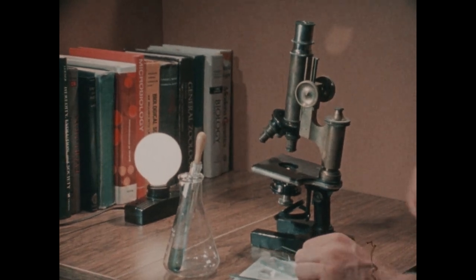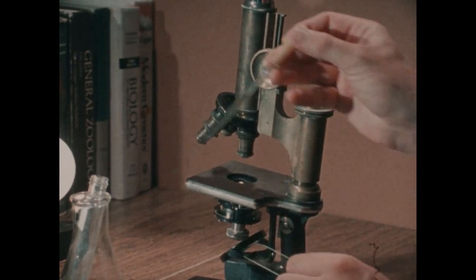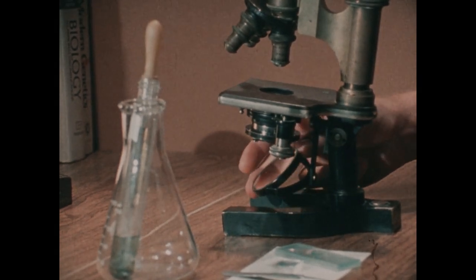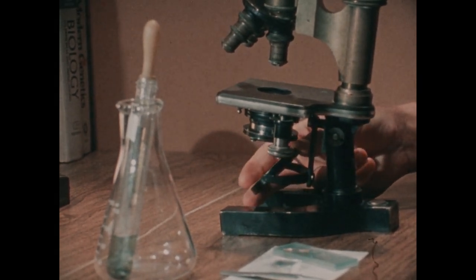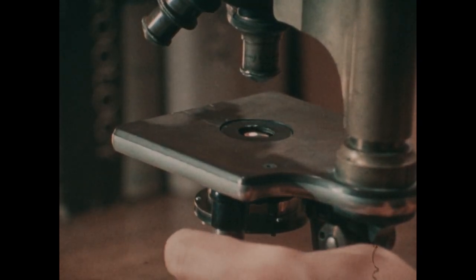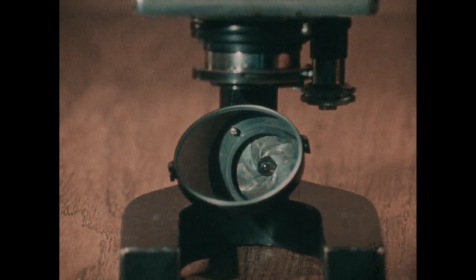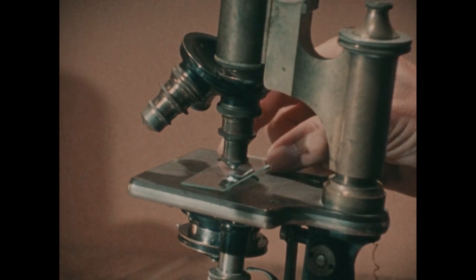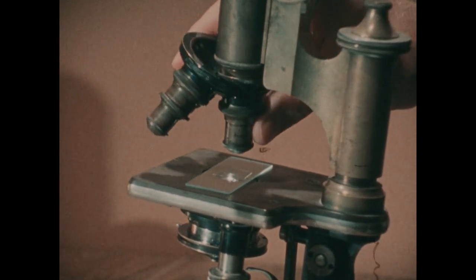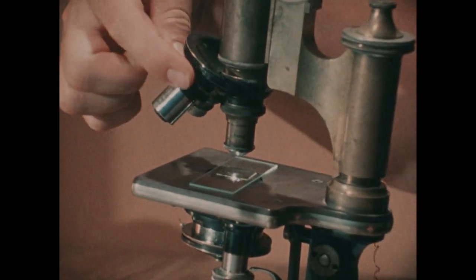This brass instrument, made around 1900, shows all basic microscope parts, a design that hasn't changed in over 100 years. There is a mirror directing light into the microscope, a condenser lens used to focus light onto the specimen, and beneath the condenser, an iris that controls light entering the imaging system. A stage holds slides, and above it, most microscopes have a rotating turret with objective lenses, easily replaced with modern objectives for better imaging.